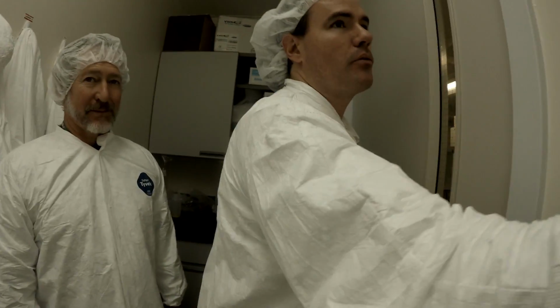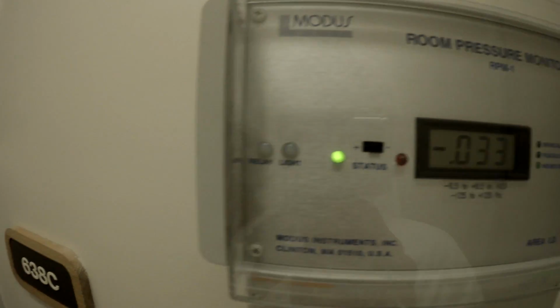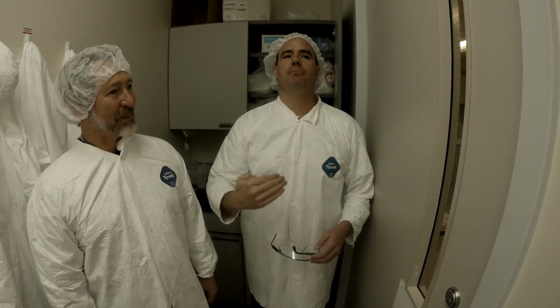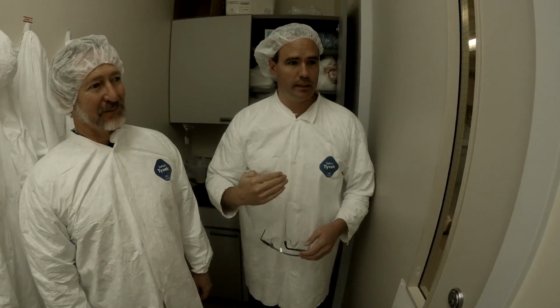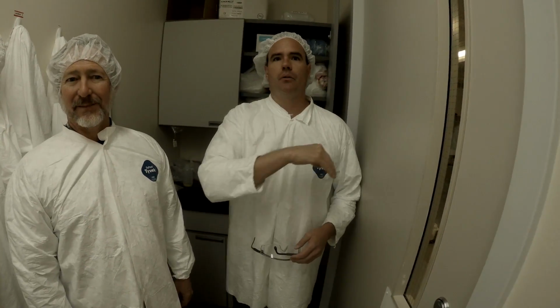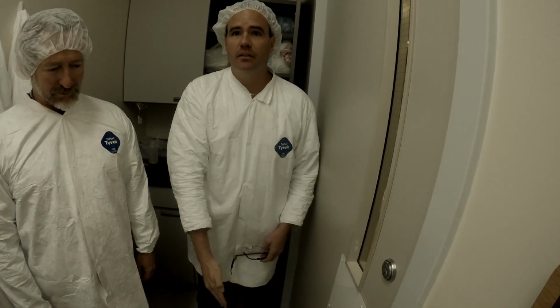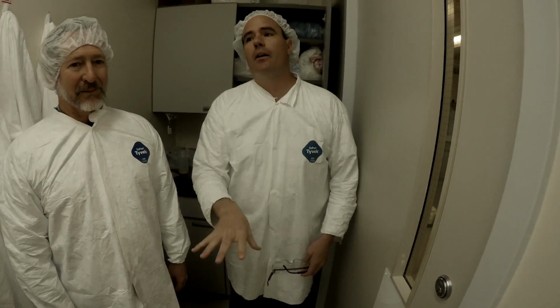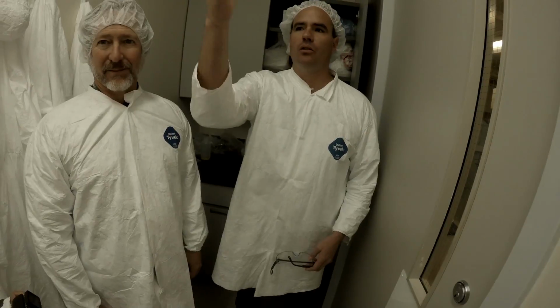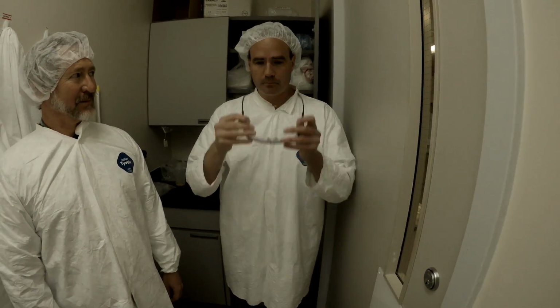Also, in every room in the lab, there will be one of these, which basically describes the air pressure. The thing that makes the clean lab so clean and allows it to stay so clean is that the inside is at a higher air pressure than this room. So any dirt that does fall to the floor gets swept out by air moving underneath the door, and this room is higher in pressure than the one out there, and the one out there is higher than the hall. So as you go in farther and farther, it should get cleaner and cleaner.